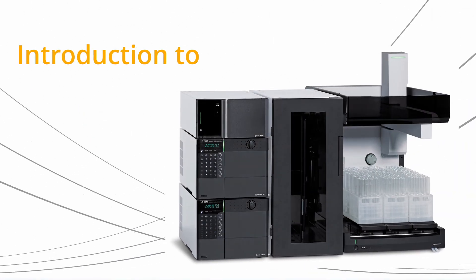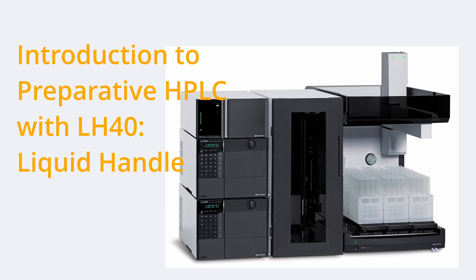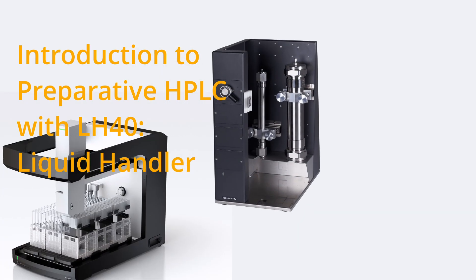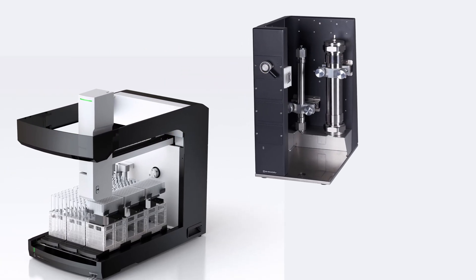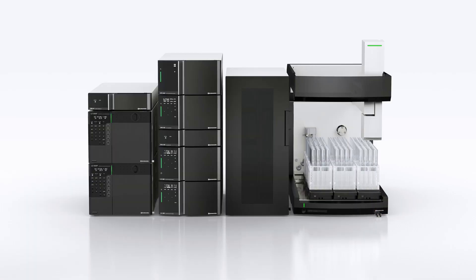Welcome to this introduction to Preparative HPLC and the LH-40 Liquid Handler. In this video, we'll explore key concepts in fraction collection and sample injection techniques, focusing on how the LH-40 enhances efficiency and precision in preparative chromatography.